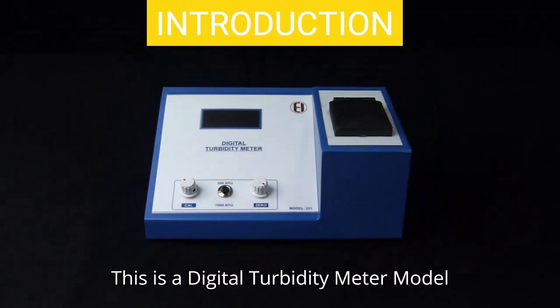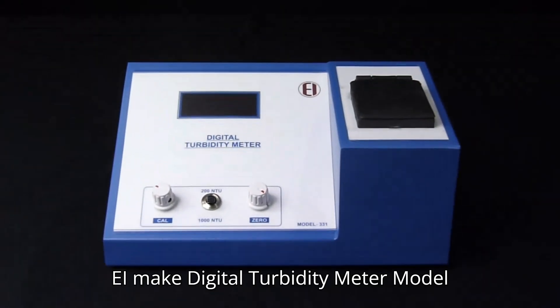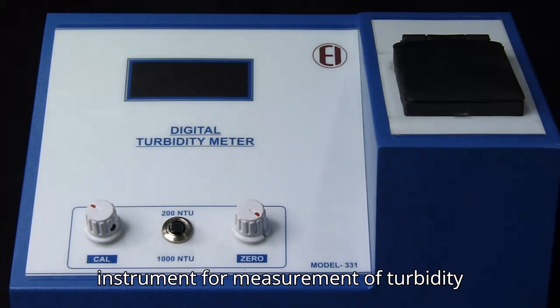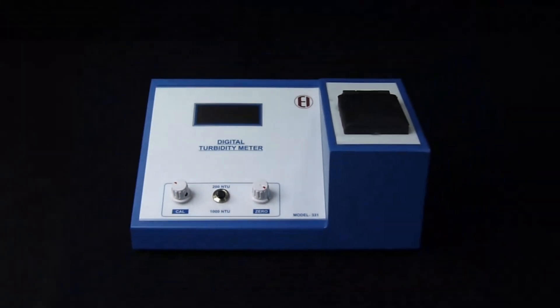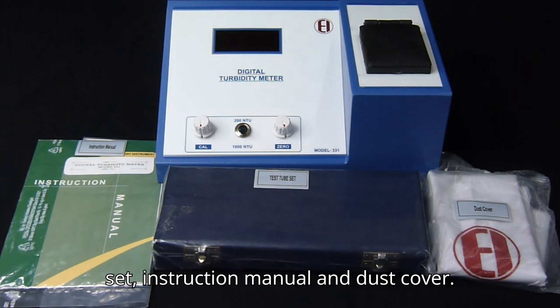This is a Digital Turbidity Meter Model 331. EIMAKE Digital Turbidity Meter Model 331 is a very accurate and stable instrument for measurement of turbidity up to 1000 NTU. The instrument is supplied with a test tube set, instruction manual, and dust cover.